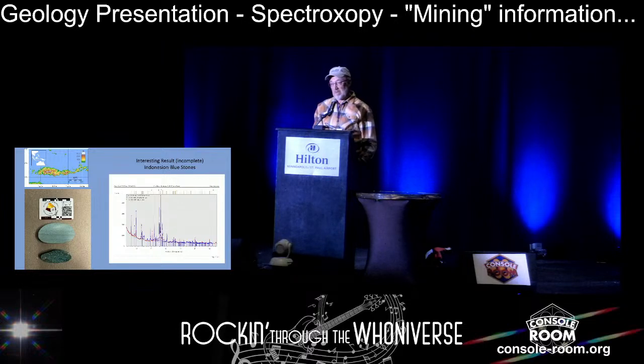And we're probably going to use the next tool to help us answer that question. But that was astounding to me, that I can look at a rock and just based on color know that it's from halfway across the planet. Not always the case. So diffraction we use fairly frequently, and it's one of the tools in our arsenal for figuring out basically what minerals are present in a sample.